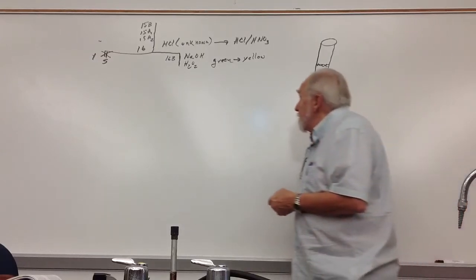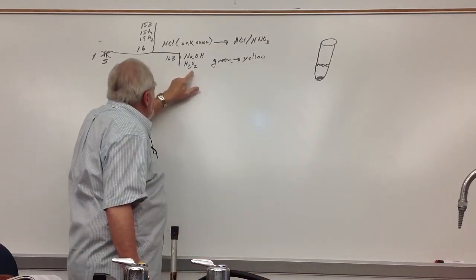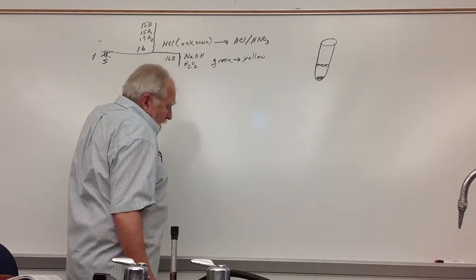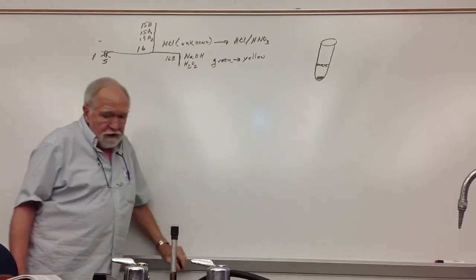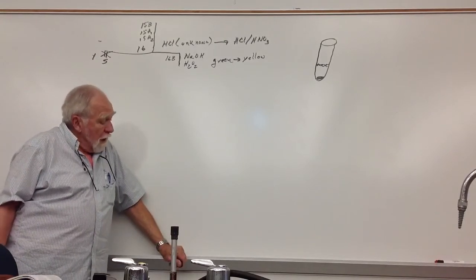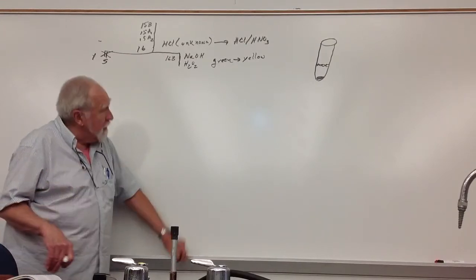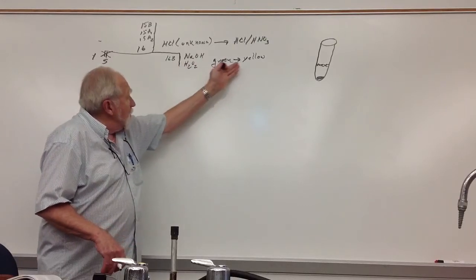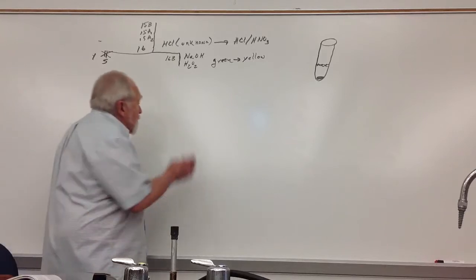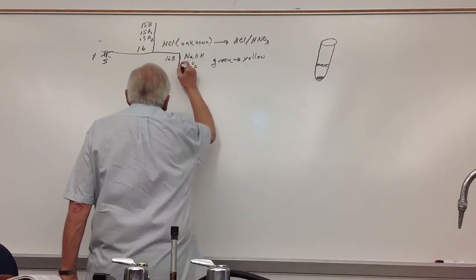So the same thing back here when you're adding this hydrogen peroxide. The reason you're taking it out of the casserole is because of the black precipitates that form when you add hydrogen peroxide. In other words, the cobalt 2 hydroxide goes to a black precipitate. The manganese 2 hydroxide goes to MnO2, which is a black precipitate. And with the black precipitate in the casserole, you can't see this color change. Once you've decided that you need more hydrogen peroxide, you add some to the casserole also. Put this back in the casserole. Okay.